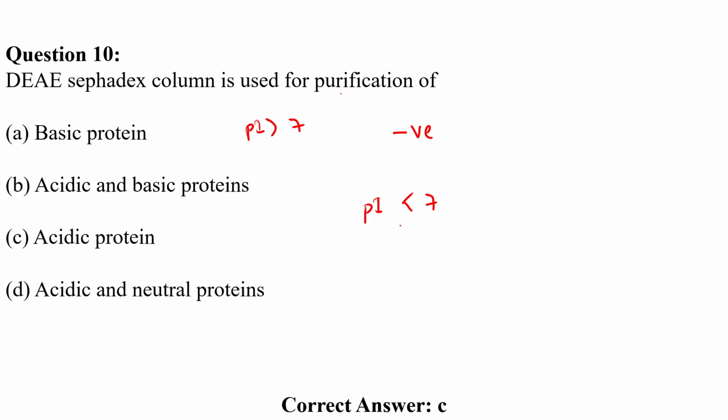For a pI less than 7, imagine pI is a wall. Now my pH is around 7. No one will do the purification at a very acidic pH, because generally things get denatured and it's not suitable for the system to be handled at a very high or very low pH.